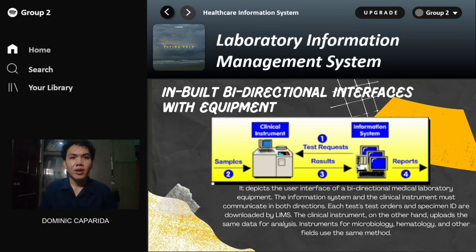Instruments for microbiology, hematology, and other fields use the same method. So as what you can see on the figure, these interfaces are bidirectional. So the clinical instrument and the information system, they correlate with each other. They help each other to develop and function.